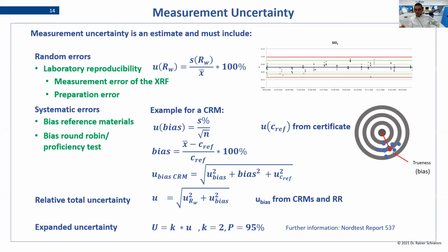And then after that week, you already have a small selection of statistics, and then you start to calculate your limits. Then you observe this over time, and step by step you readjust this, and in this way you also get good experience of your data. And you will see, the longer you measure, the better your data is, and the better your control limits will fit to the real laboratory situation.